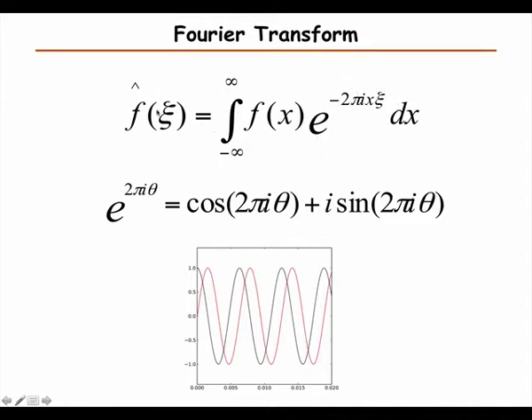The transformation in the frequency domain is a complex function, and if we take the absolute value, then we get the amplitude. But we need both the real and the imaginary part because we also need to define the phase.